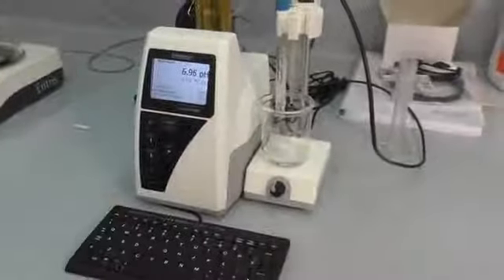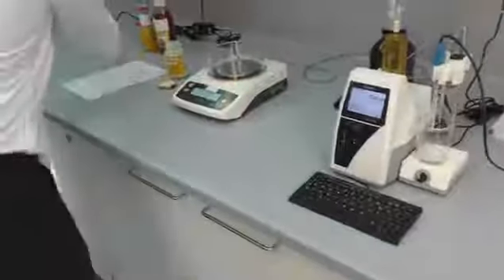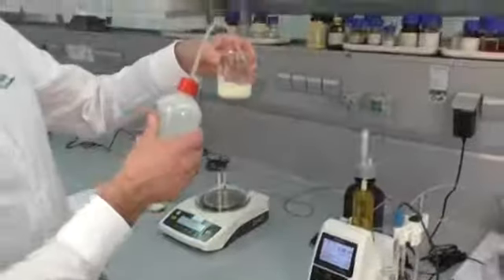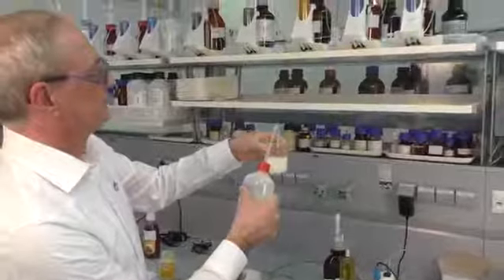Now we add a stirrer bar to the beaker and add 80 to 100 milliliter of deionized water.